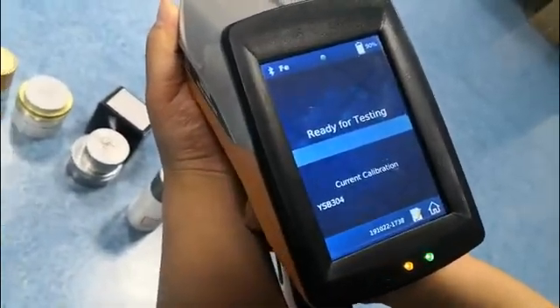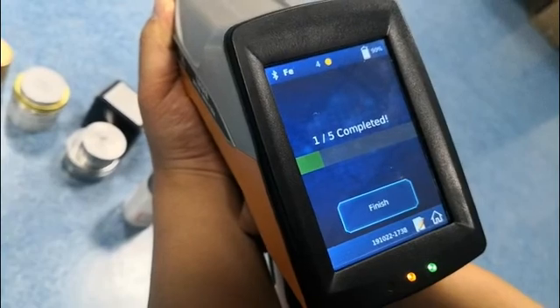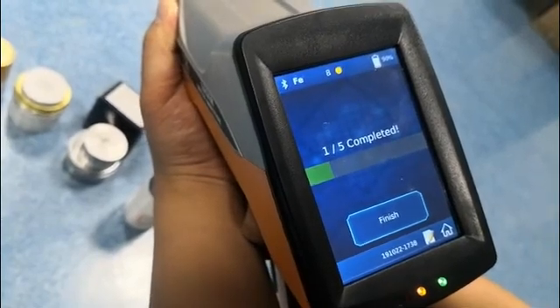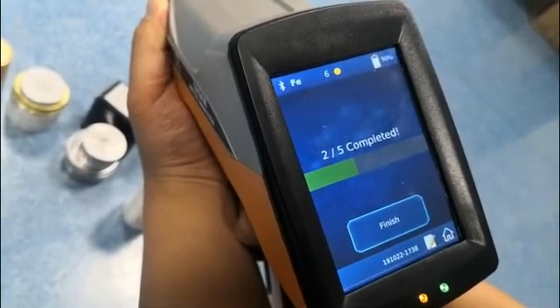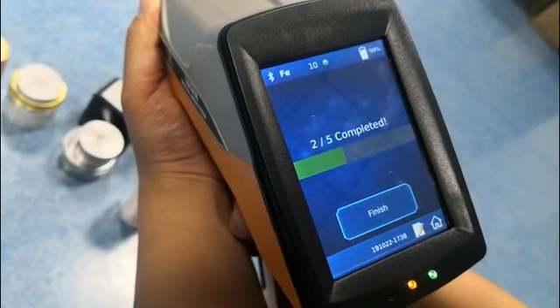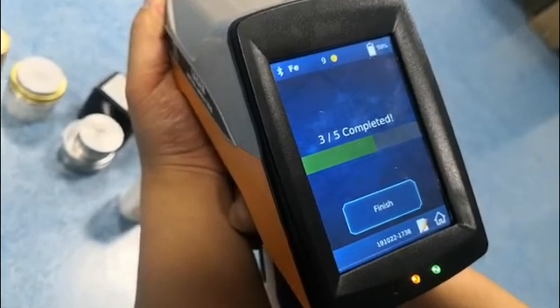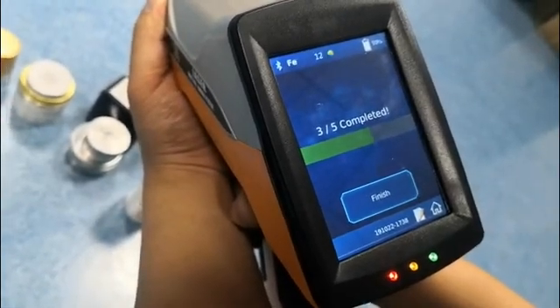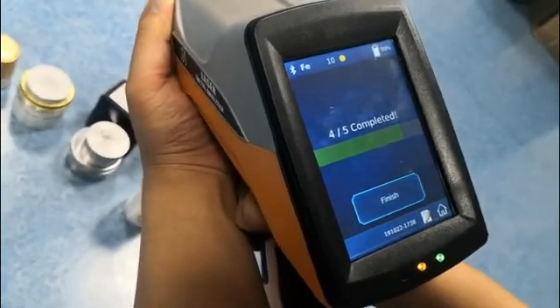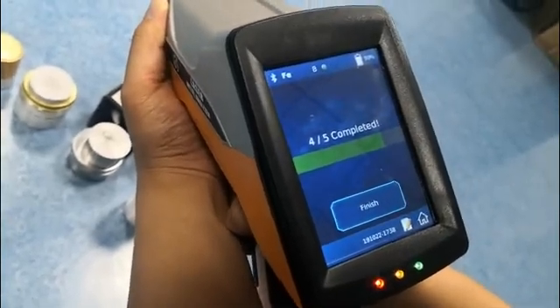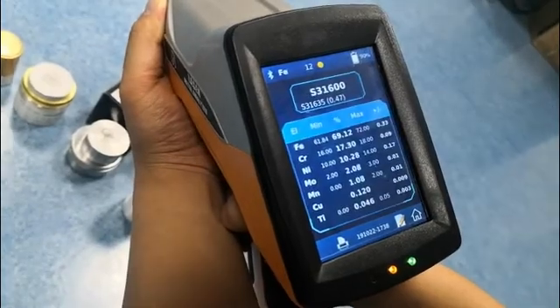One time, two times, three times, four times. Okay, five times. The result is out.